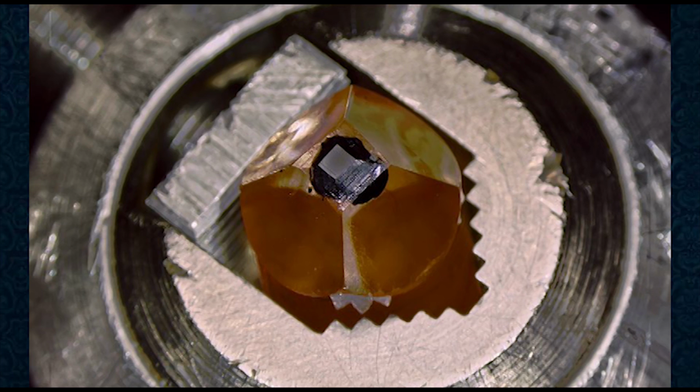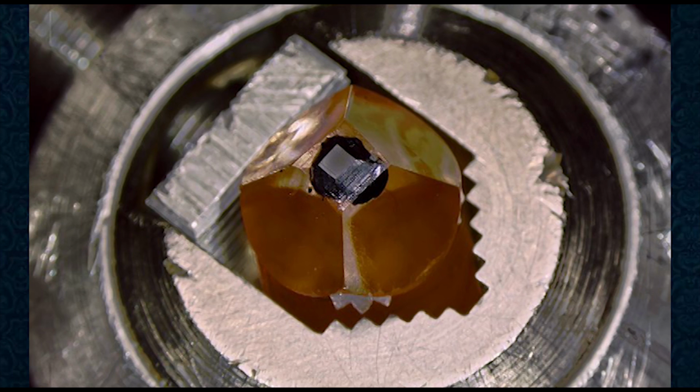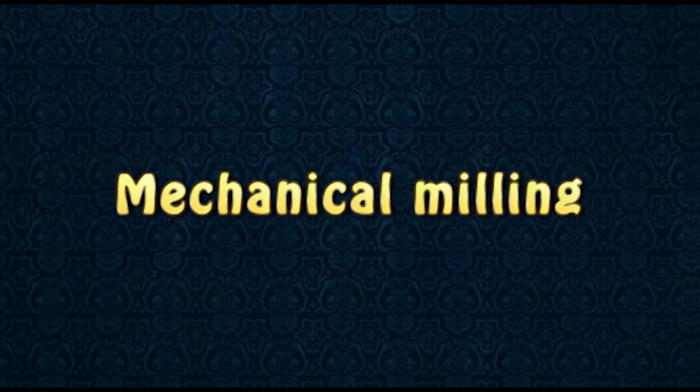One way in which this is achieved is by encasing the sample in resin, then cutting it with a specialized diamond blade to create ultra-thin sections of around 70 to 350 nanometers in thickness. The resin is used in order to help prevent deformation or destruction of the sample during the sectioning process. Another process exists called mechanical milling, wherein a sample is mechanically polished down until it is of the desired thickness.